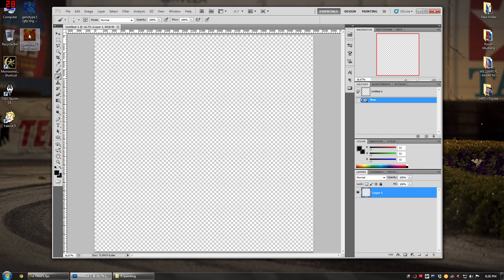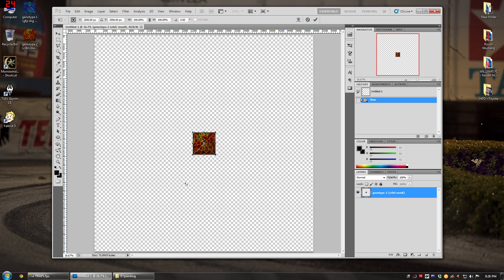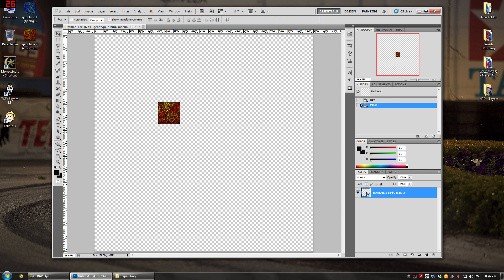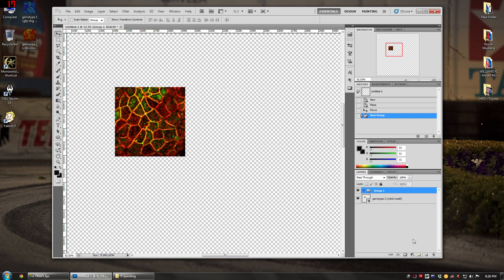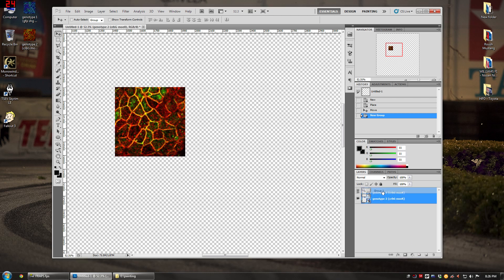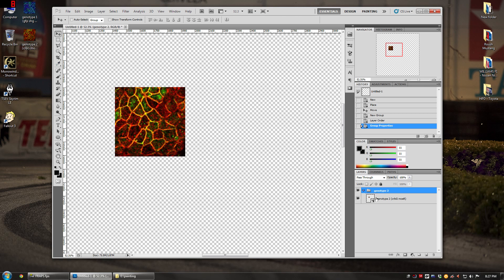Drag your image onto the canvas to import it, then press Enter to accept it. I usually make a group to keep things organized, because all these channels and layers will get messy otherwise. Click the little folder icon to add a new group, drag your layer into it, and double-click the name to rename it — for example, 'Genotype 2.'